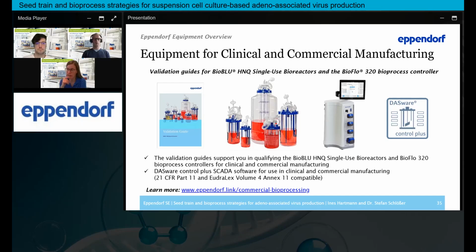Of course, on the other hand, there are alternative flask types, special alternatives like optimum growth and so on. They have special baffles. We have also had good results with these flasks. So both are fine to use. Pros and cons. Give it a try.